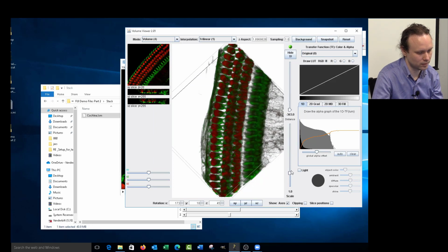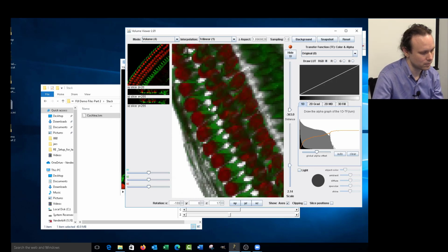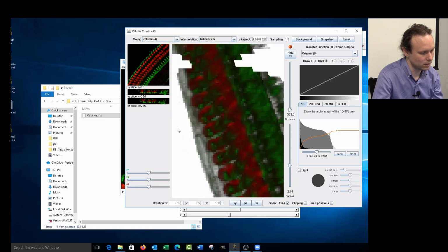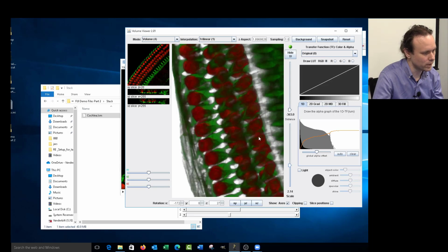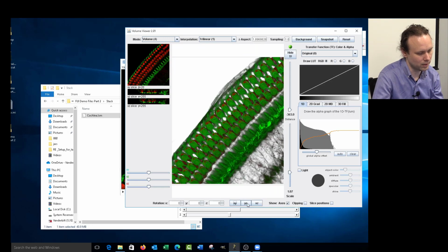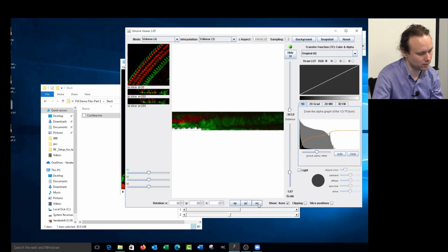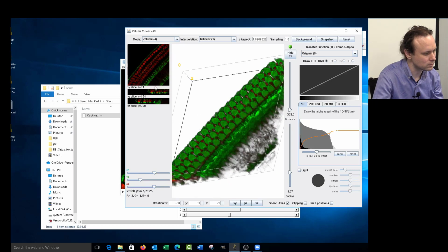And right here is scale. Right now this is at scale 1, but I like to zoom it in a little bit to see what I'm looking at. In this one, we can do a couple different things. We can look at different planes just by clicking them. XY is just your typical top-down plane. Here are your side planes. And we can also do arbitrary planes by dragging these through.